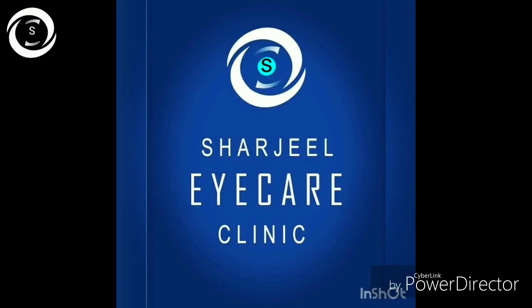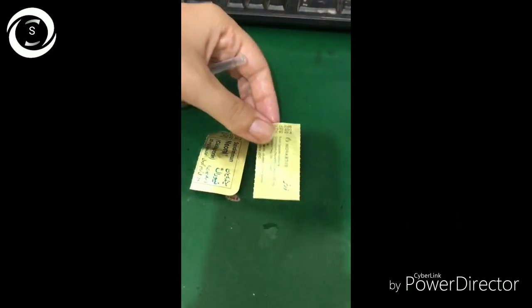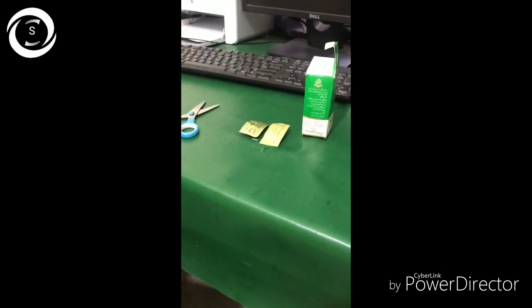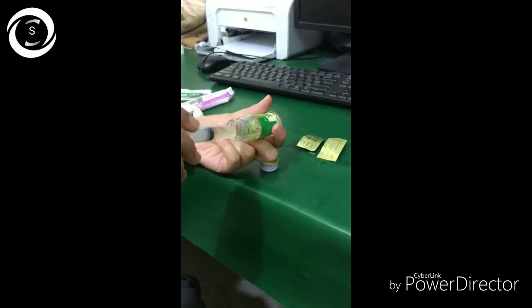I am Dr. Sharjee and today I would like to show you how to make cyclosporine eye drops with the help of Dr. Sadia. For that you need distilled water 5 ml or castor oil 5 ml, Sandimmun Neoral 25 milligram tablet, a scissor, and a 1 cc syringe. First of all, you take 5 ml castor oil and put it in the drop bottle.